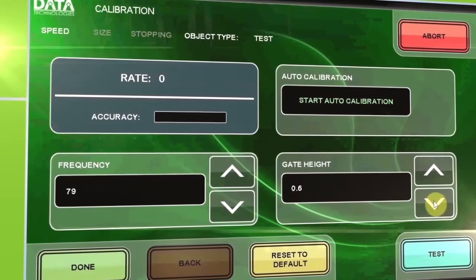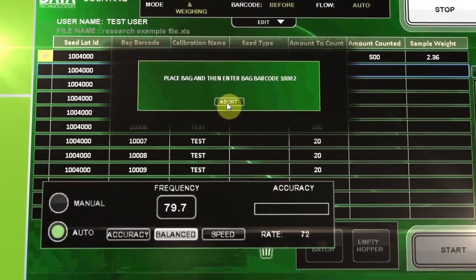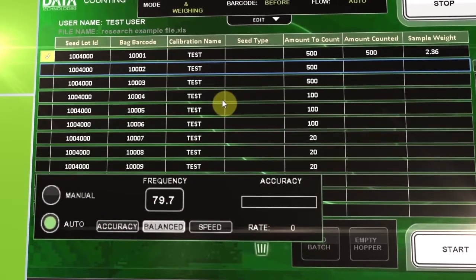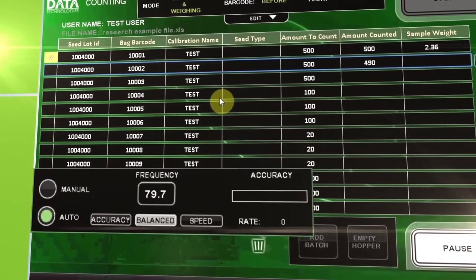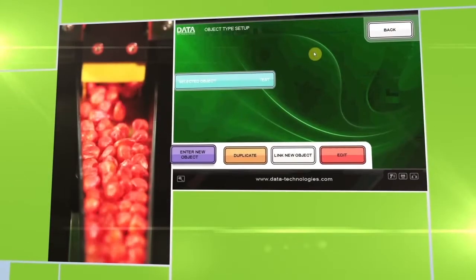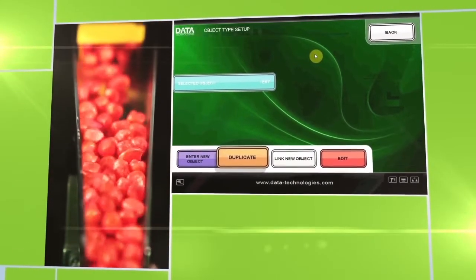Automatic real-time calibration of various seed types assures maximum accuracy and speed, preventing human counting errors. The software features a clear, multilingual user interface.